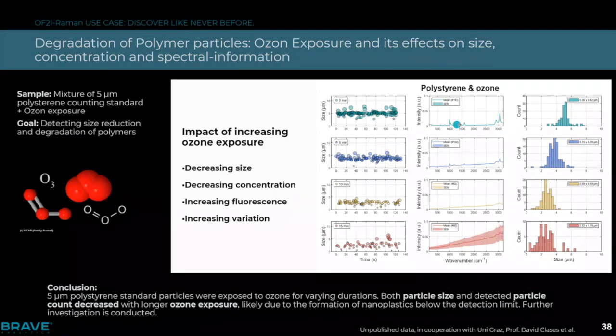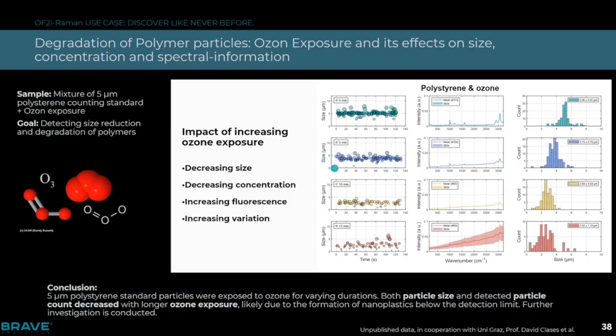So really a real-time approach. And we were able to see the size distribution, so a count and a size distribution, all in real time.